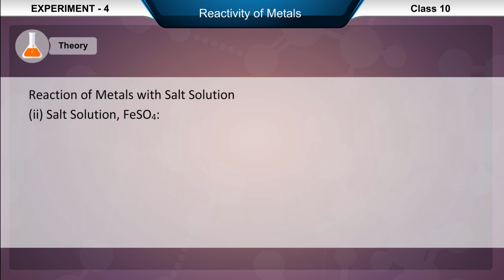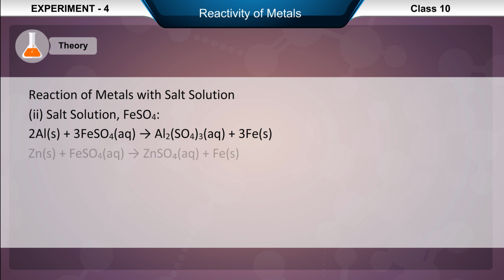2. Salt solution, FeSO4. 2Al in solid state plus 3FeSO4 in aqueous state results in Al2(SO4)3 in aqueous state plus 3Fe in solid state.